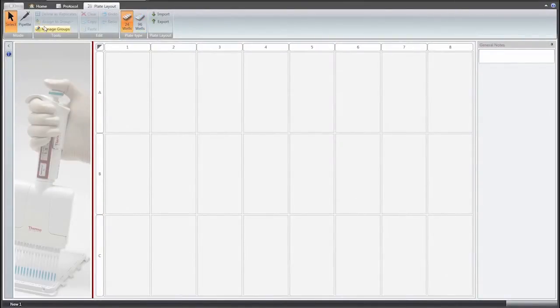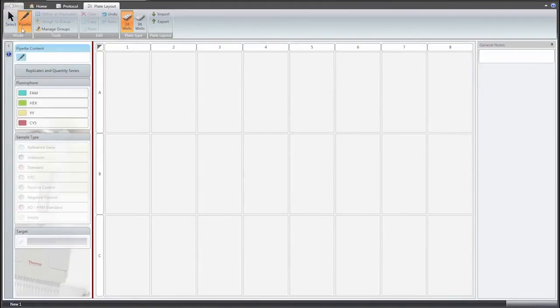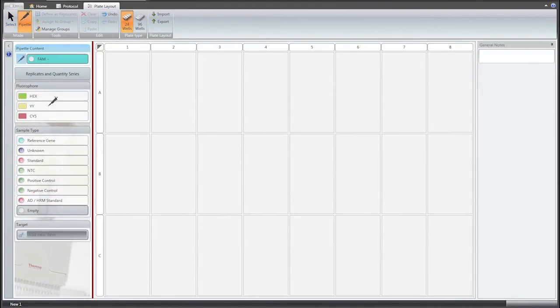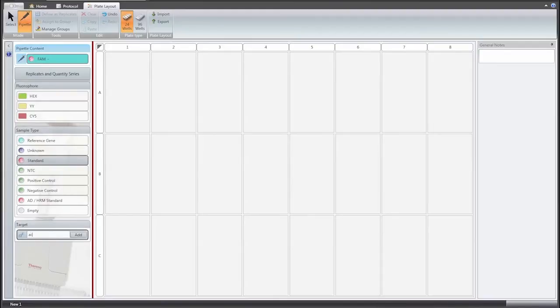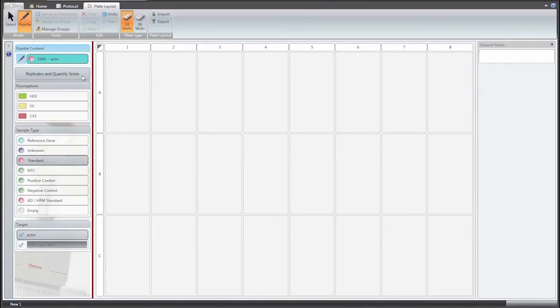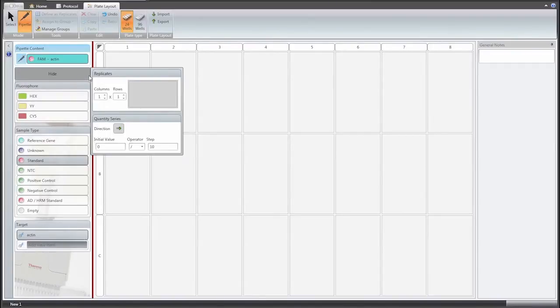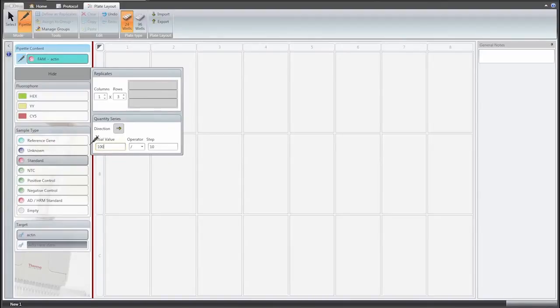Creating a plate layout is convenient and fast with the virtual pipetting tool. The information of the fluorophores, sample types, replicates, targets as well as concentrations for standards is loaded to the virtual pipette tip and then pipetted to the designated wells.